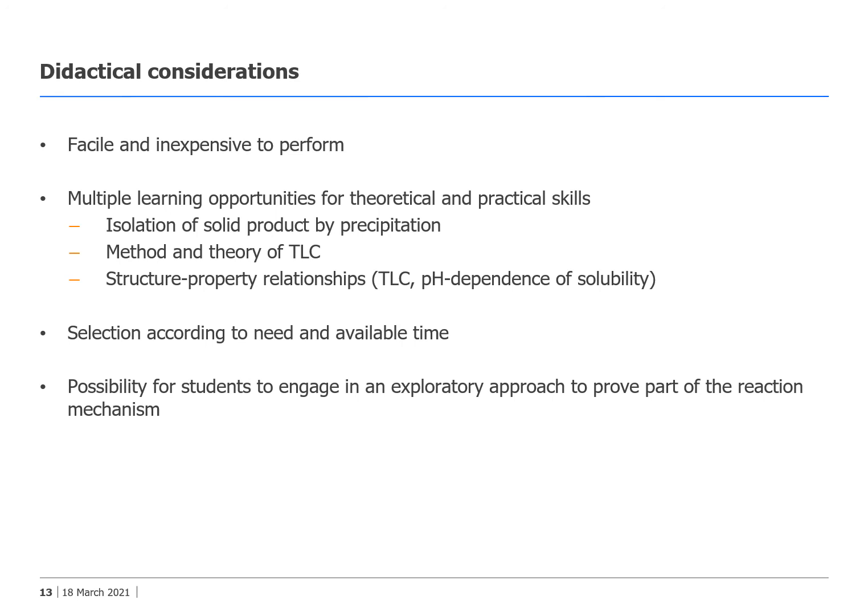From a didactic point of view, the experiments offer multiple opportunities for theoretical and practical skills. The isolation of solid product by precipitation is a common and essential laboratory method. The same applies to TLC, and the theoretical basis of the influence of polarity on TLC can also be explained here. Furthermore, structure-property relationships can be illuminated in the TLC and precipitation of the product. The selection of the experiments should therefore be made according to need and available time.